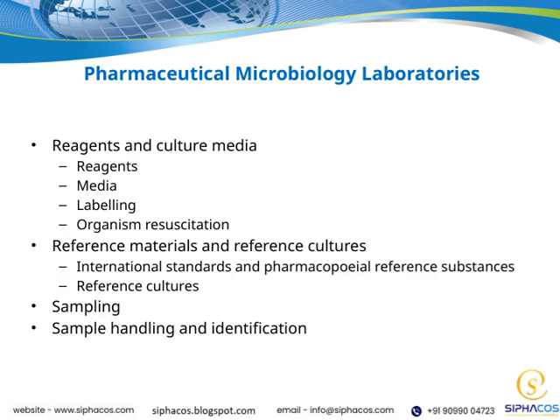International standards and pharmacopoeial reference substances guide us in maintaining consistency and quality across different laboratories and regions. Reference cultures are used for calibration and validation of our microbiological methods. Sampling is a fundamental step, collecting representative samples carefully to ensure valid results.